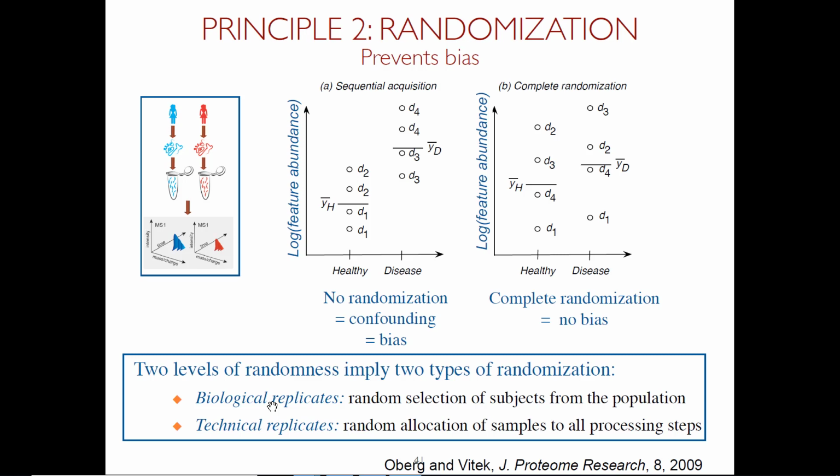For example, if you need some references for locating peaks, and things like that. So for some certain things, especially when you develop the assay still, it may be useful just to figure out how much technical variation you have. But once you have an assay which you have well under control, you know what you're doing, you will be much better off using every run for a new biological sample.